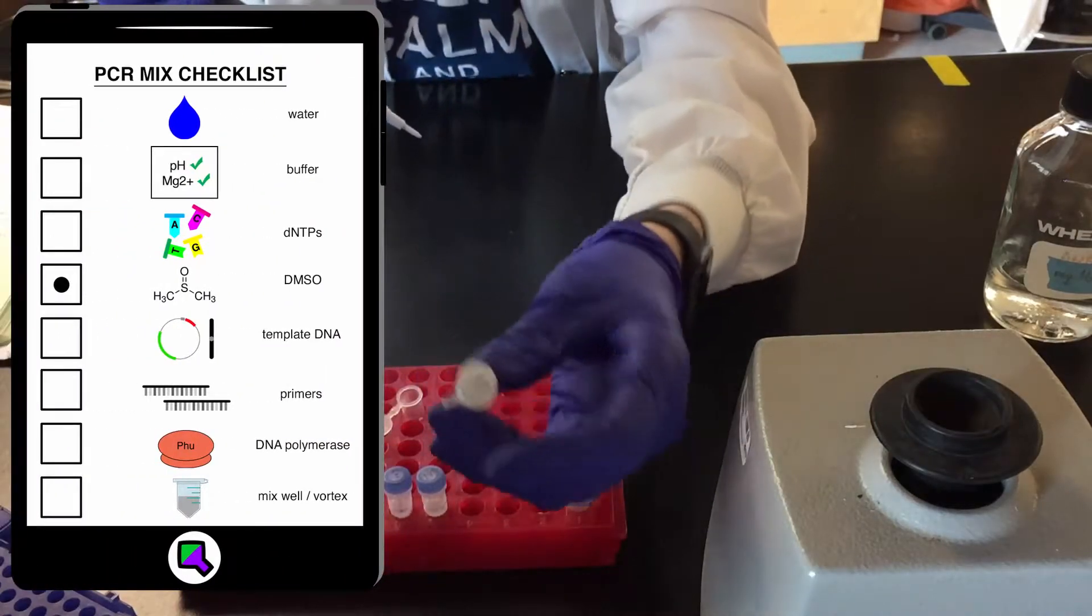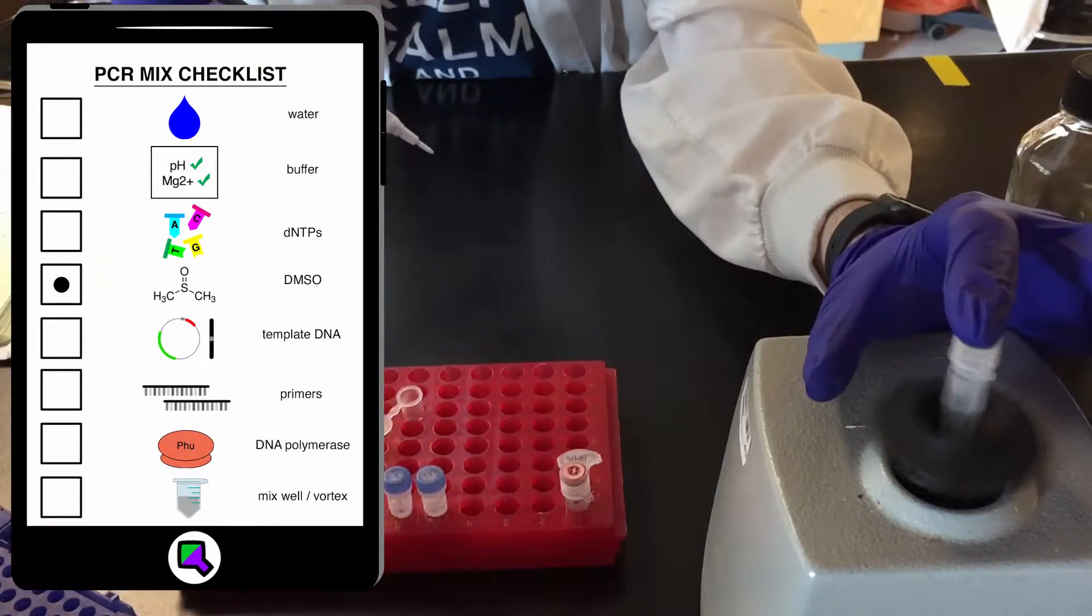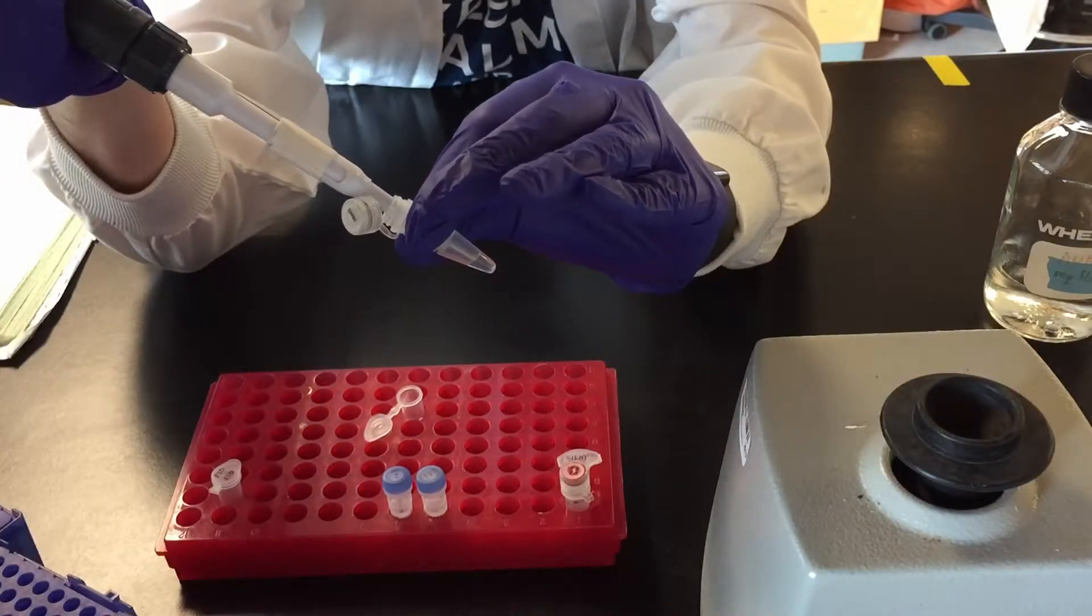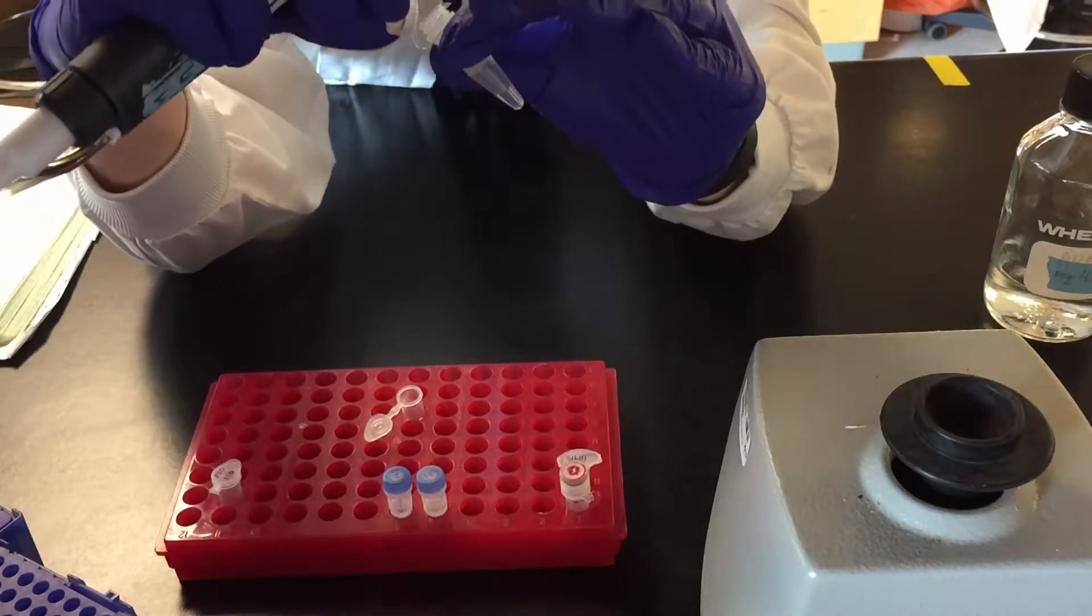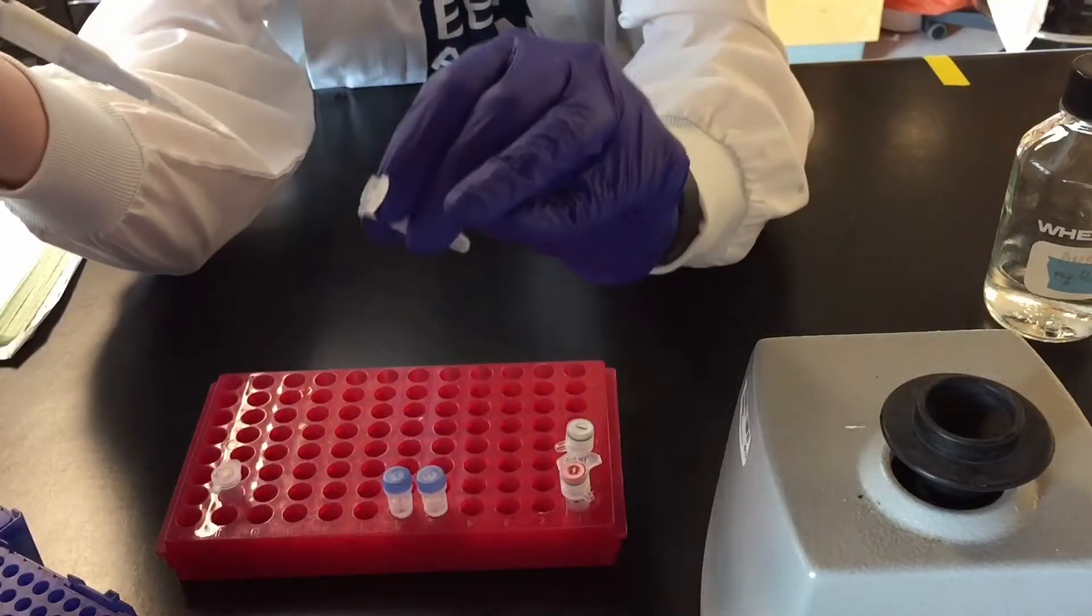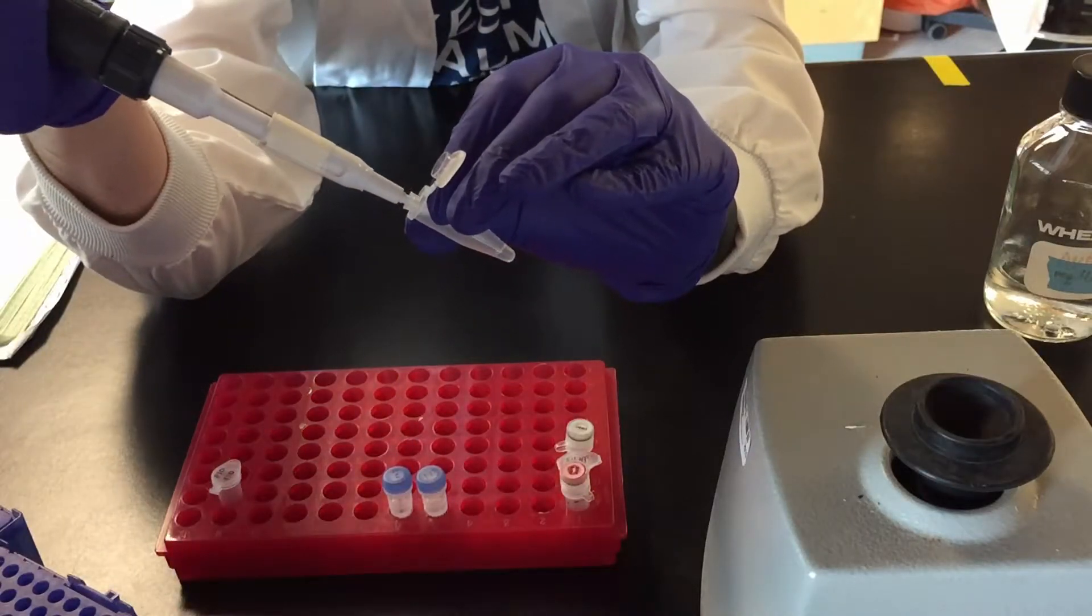Some PCR reactions include DMSO which helps reduce secondary DNA structures by binding cytosine residues. Primers are usually GC rich so this helps them anneal to the template.